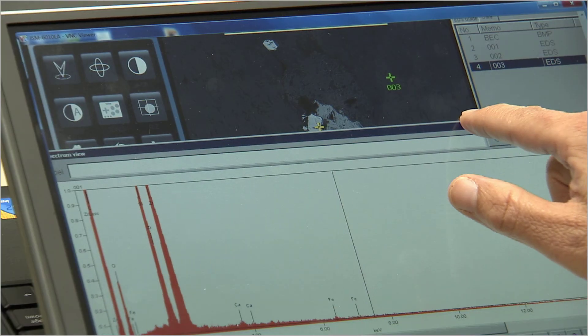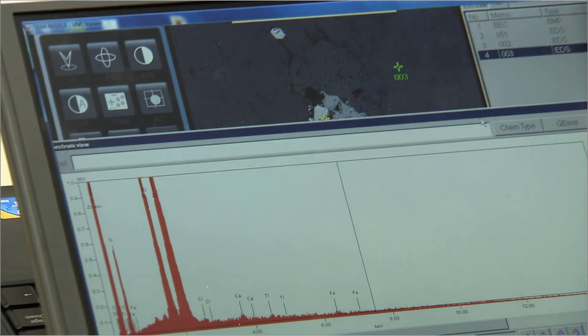InTouchScope can be used in collaborative settings and operated remotely, enhancing the interactive value of conference calls and meetings.